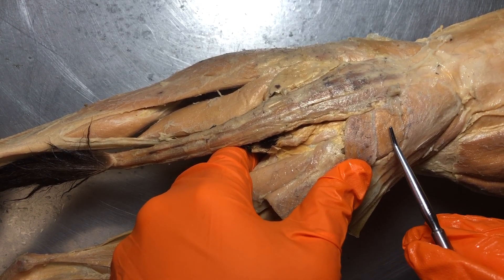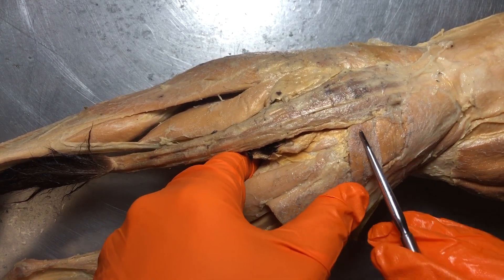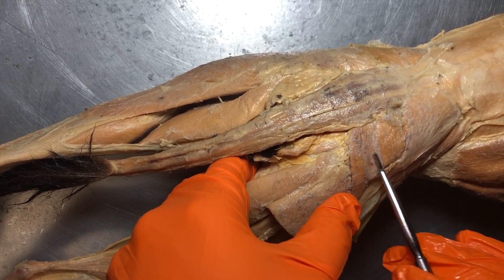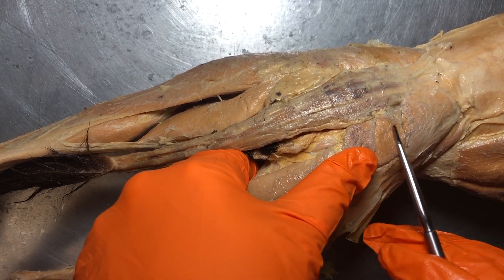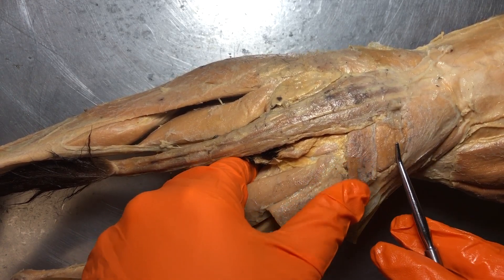On the cat, just remember the maximus is actually the smaller one. This muscle right here is called the caudofemoralis — you don't need to know that, just pointing it out so you don't confuse it. For my students, you just need to be able to distinguish the gluteus medius and the gluteus maximus.